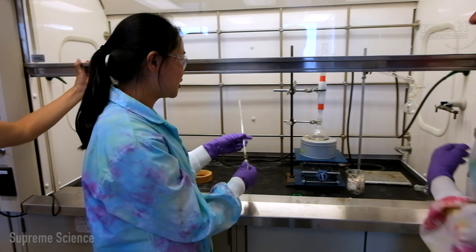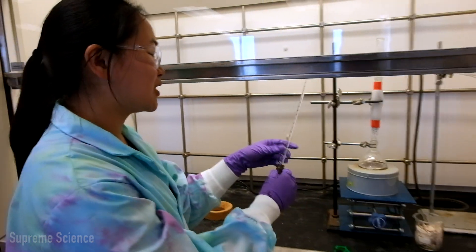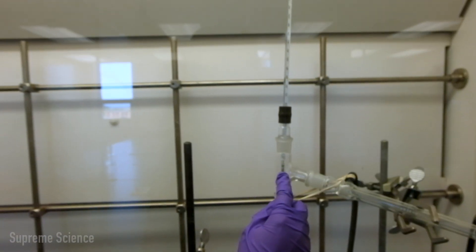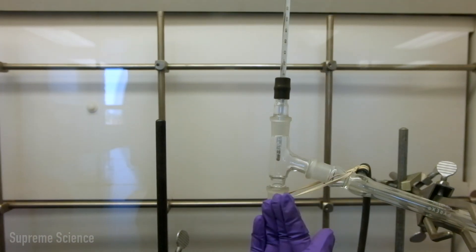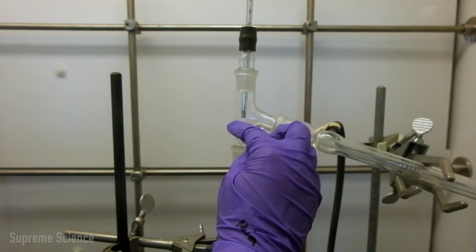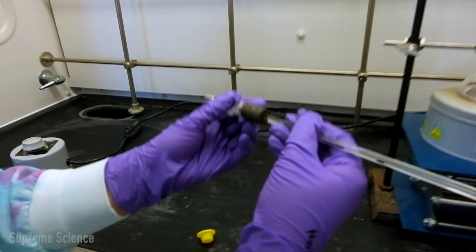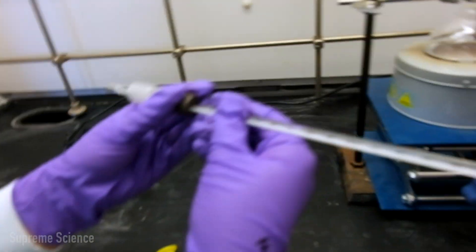The last thing that you want to do is add your thermometer, which is in your thermometer adapter. What's important is you want your thermometer to be right in the middle between the still head and the condenser. So you will take this one out and adjust it like this, holding it tightly and close.